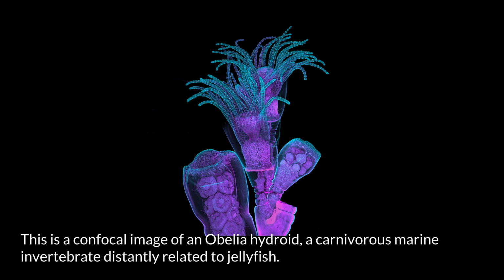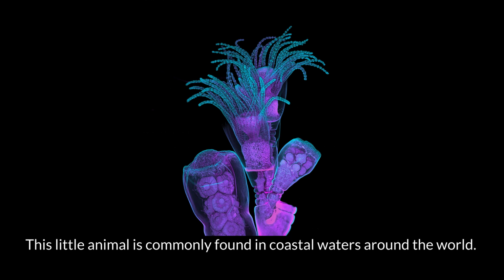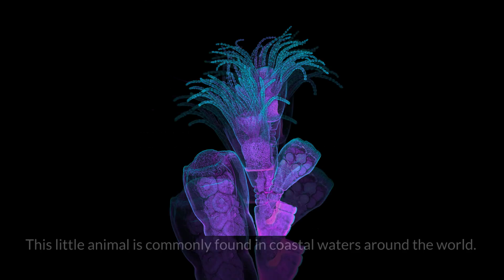This is a confocal image of an Obelia hydroid, a carnivorous marine invertebrate distantly related to jellyfish. This little animal is commonly found in coastal waters around the world.